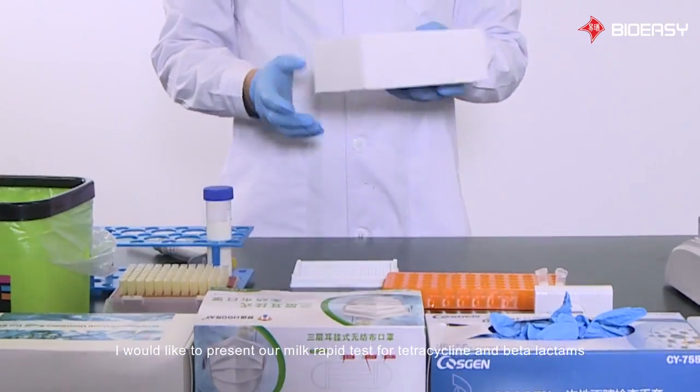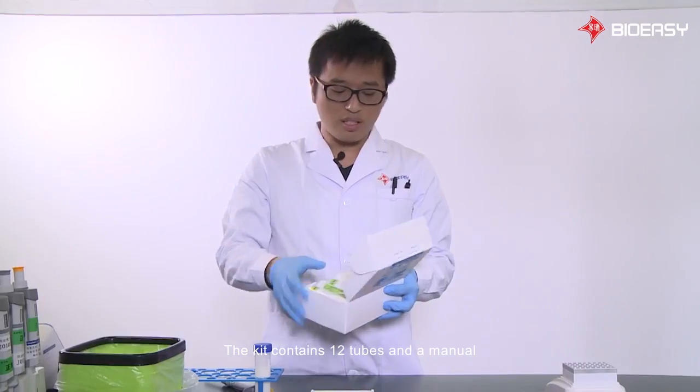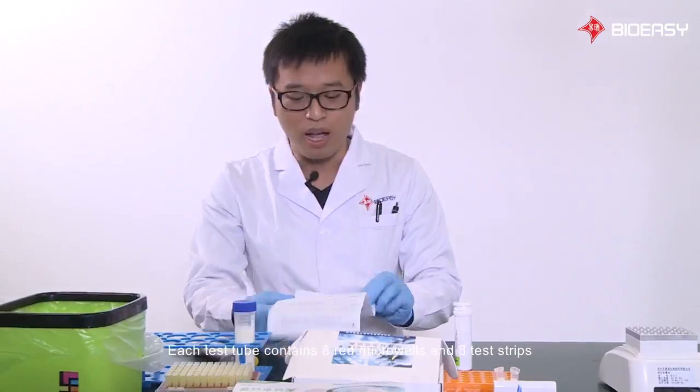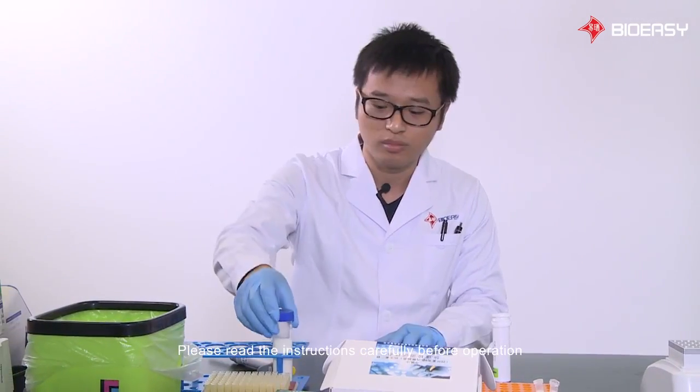I would like to present our milk rapid test for tetracycline and beta-lactams. The kit contains 12 tubes and a manual. Each test tube contains 8 red micro wells and 8 test strips. Please read the instructions carefully before operation.